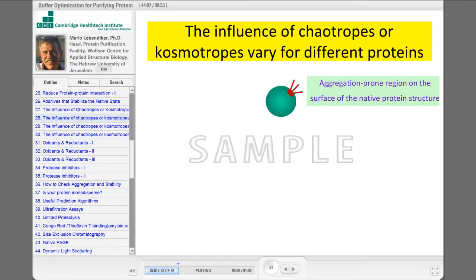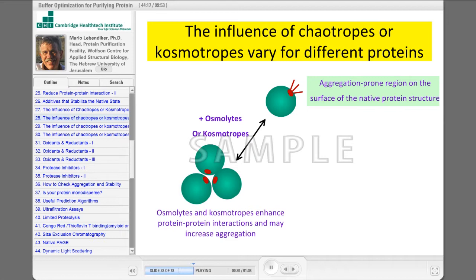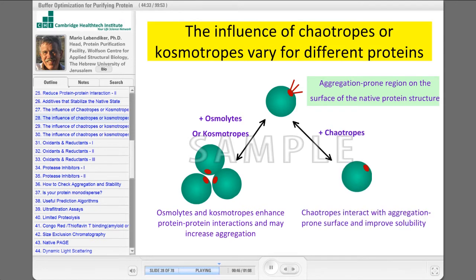For example, you have a protein where you have aggregation-prone regions on the surface of the native protein structure — for example, a hydrophobic site of the protein. So, if you add osmolytes or kosmotropes here, they can enhance protein-protein interaction and may increase aggregation. On the other side, using chaotropes, they can interact with aggregation-prone surfaces and improve solubility.